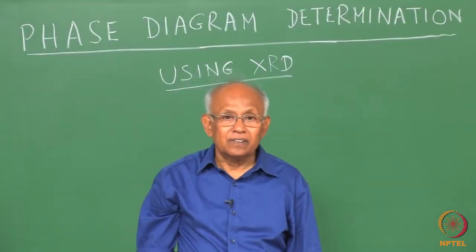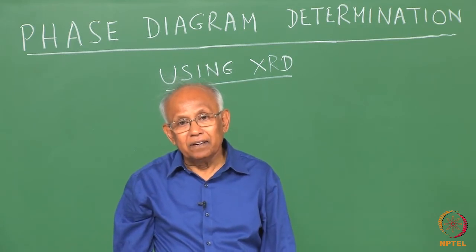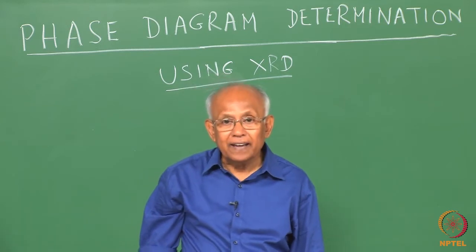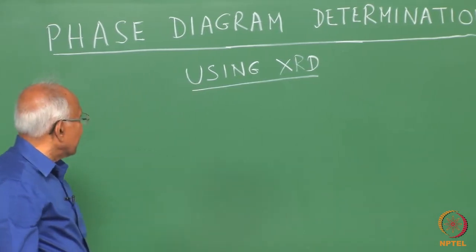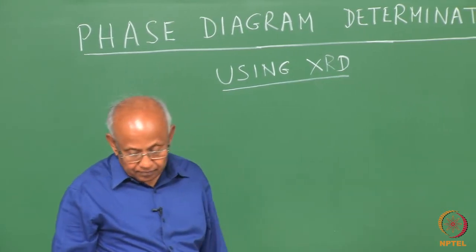In this lecture I shall deal with a very important application of X-rays, namely phase diagram determination using X-ray diffraction.